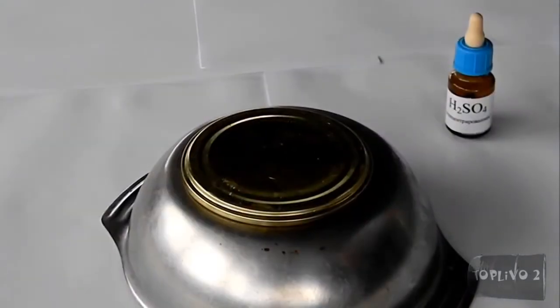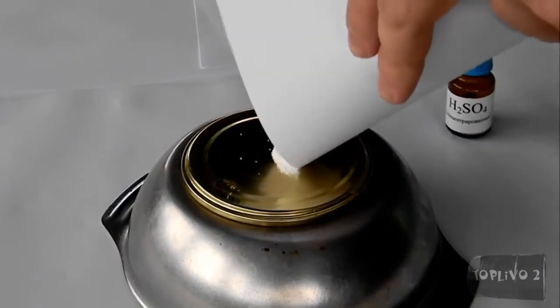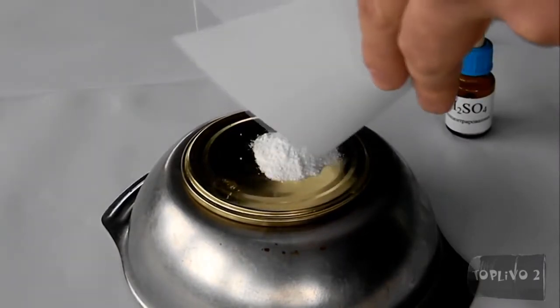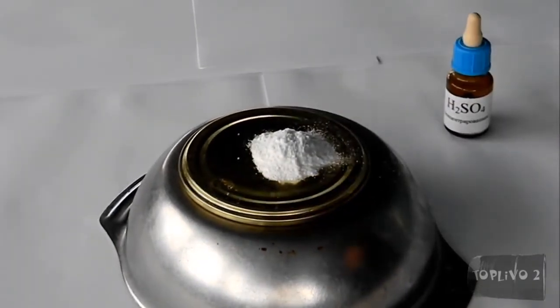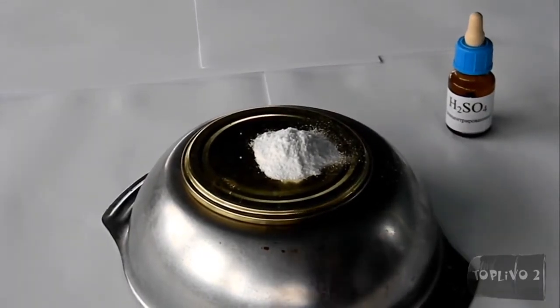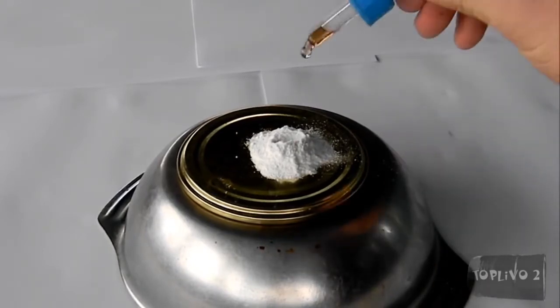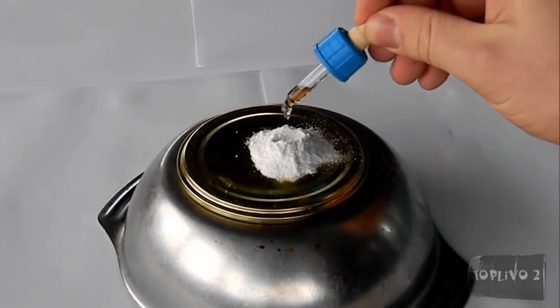Now the next reaction. I place a mixture of potassium chlorate and sugar in ratio 2 to 1. All components were thoroughly ground. To start the reaction, sulfuric acid was added drop-wise.